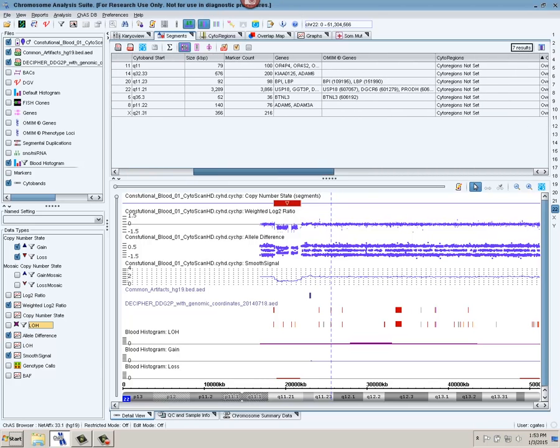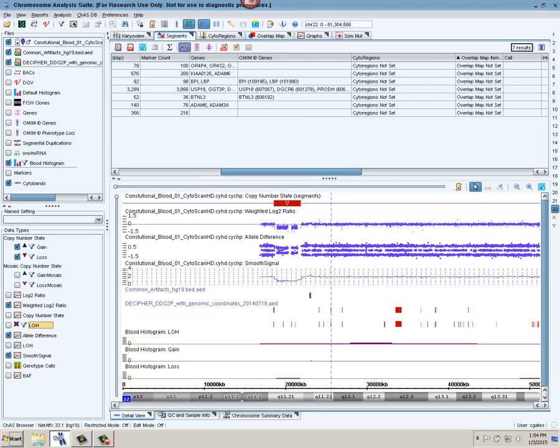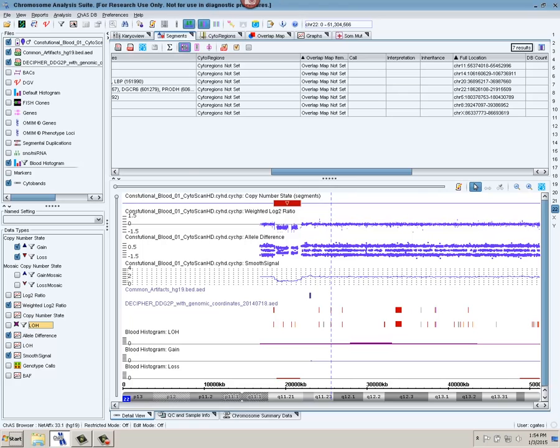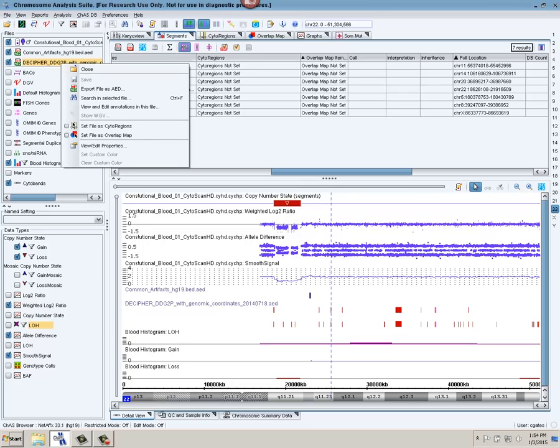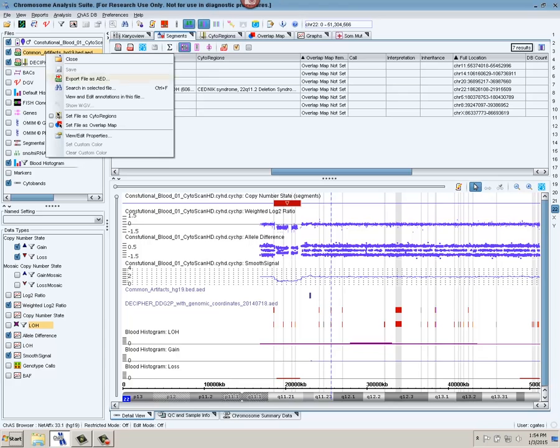So we have our file type. I'm going to scroll over. We get the copy number state, whether it was a gain or loss, and a location. And now I have two columns, one for cytoregions and one for overlap map. I'm going to set the Decipher developmental delay genotype to phenotype BED file as the cytoregions file. We now get vertical gray bars, which highlight the regions in my AED file that are clinically relevant.